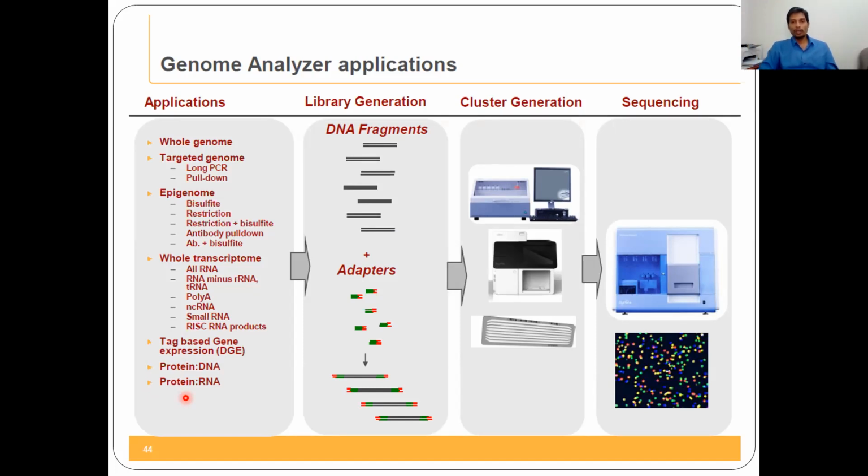But what we are doing, we are not outsourcing that. We are getting the raw data and our students analyze it on their own, because our analysis is entirely different from what they are offering. We have our own pipeline to analyze.